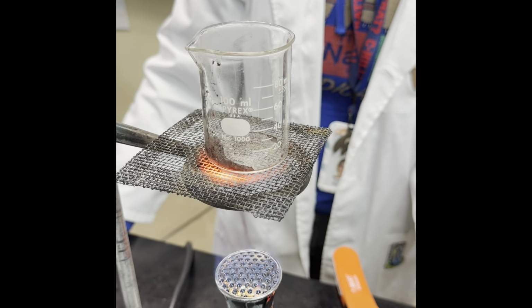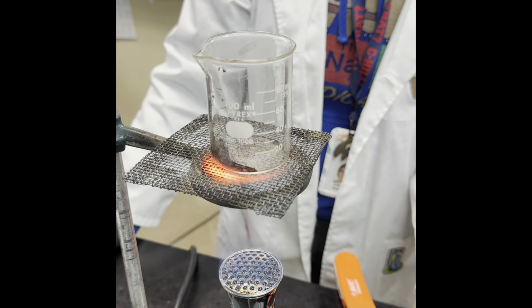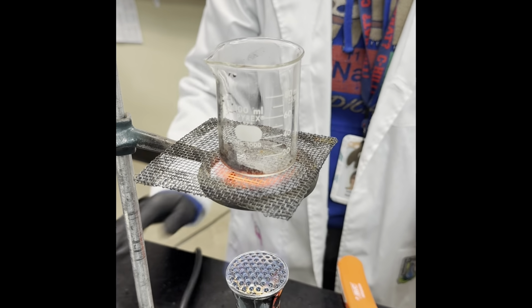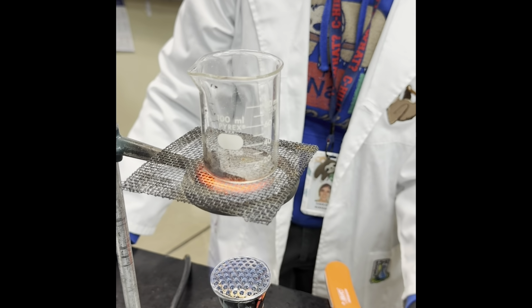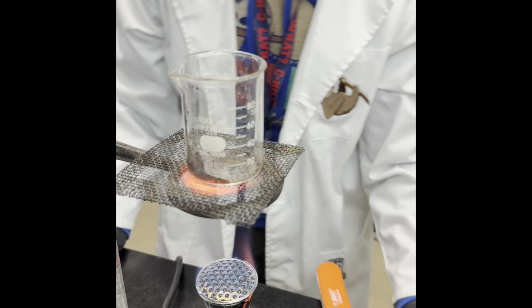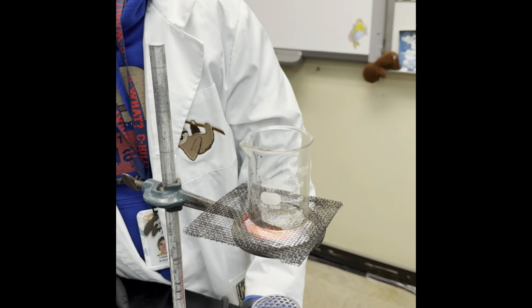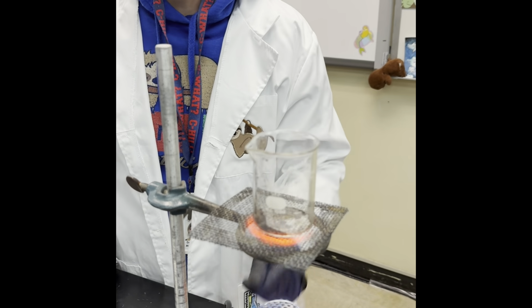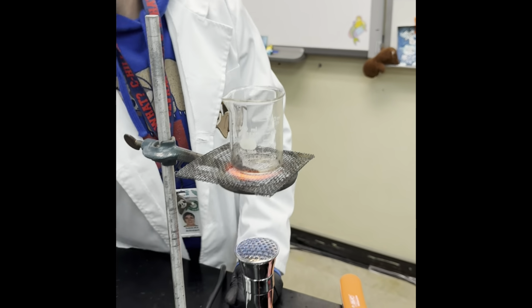Yeah, I can see the metal get very hot, really red. We would not want to touch the metal. You probably got that. That sizzling is just sizzling off the extra solution that was left. So I just want to get it till it's pretty well dry. So think about, why would we want it totally dry? Why can't we have a little bit of that in there when we mass out our product? So I'll crank this up a little bit.